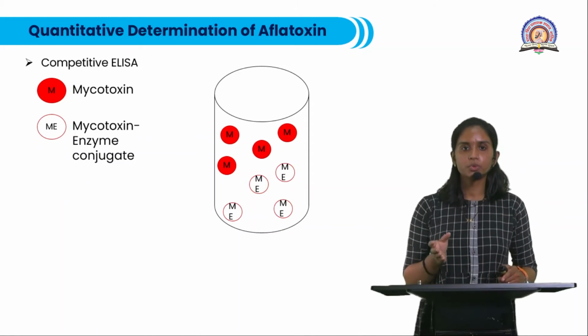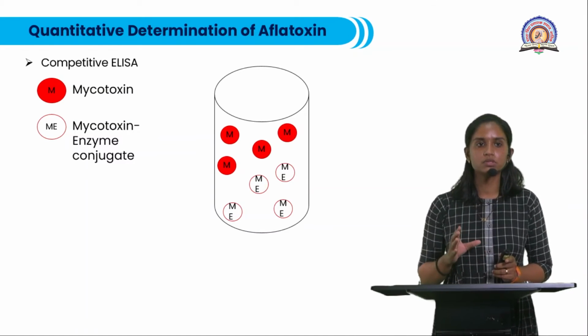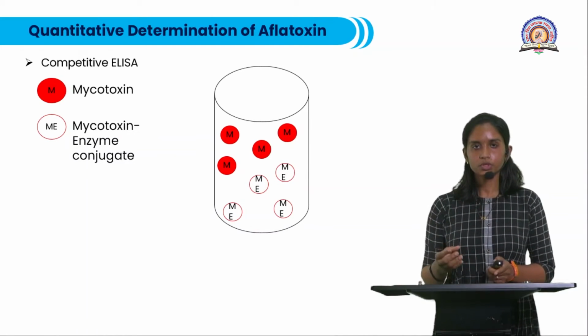So here what you know is not the concentration of mycotoxin in the sample, that you don't know. What you know is just the concentration of mycotoxin and enzyme conjugate. So you will allow this mixture to incubate.